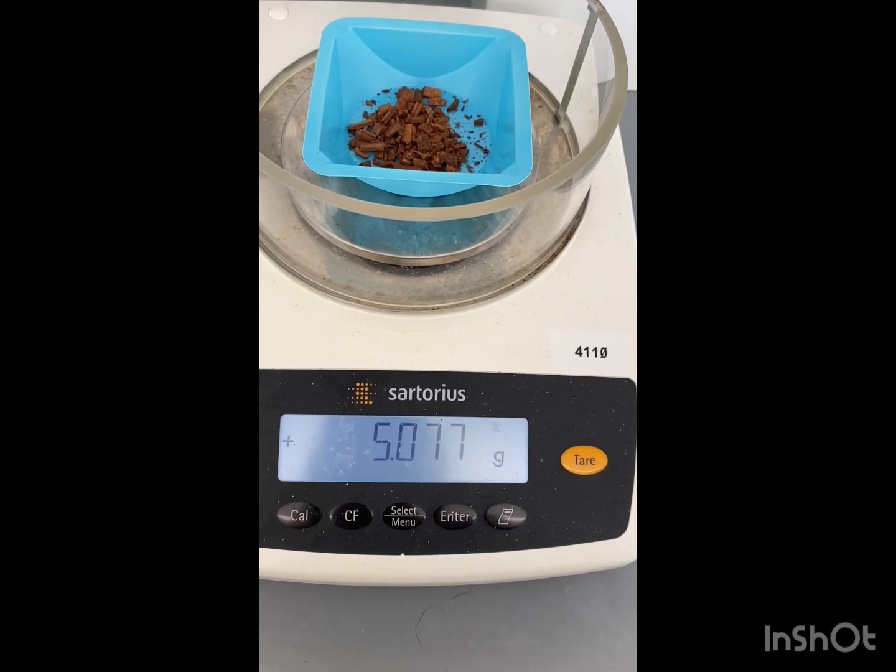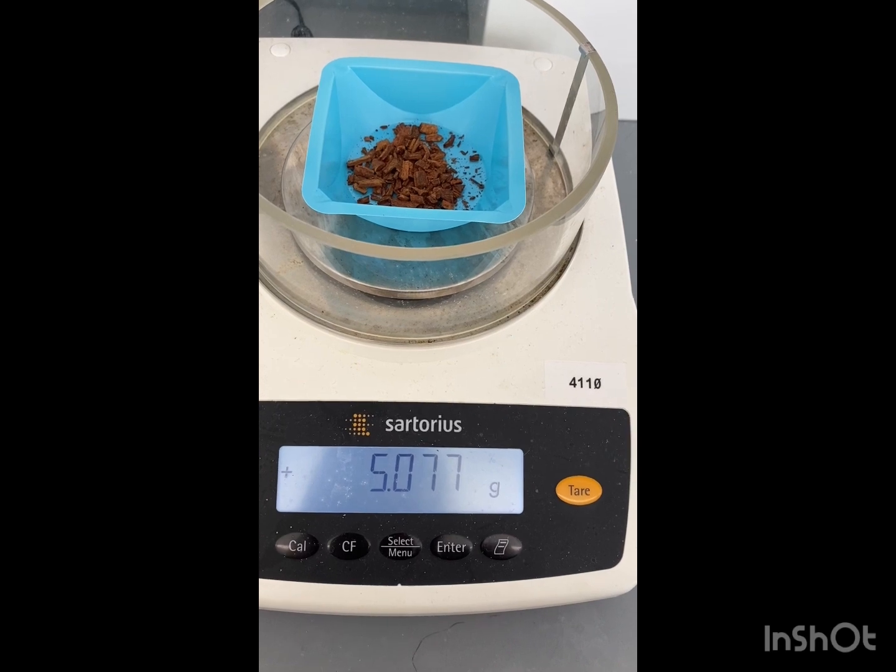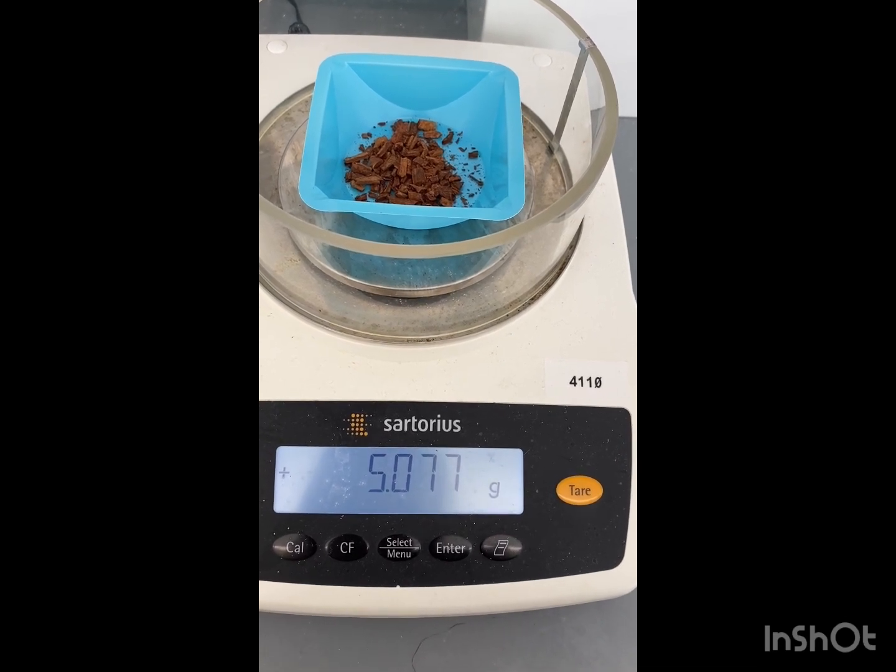So we have a mass of 5.077 grams. We're going to add this to our 200 or 250 round bottom flask.